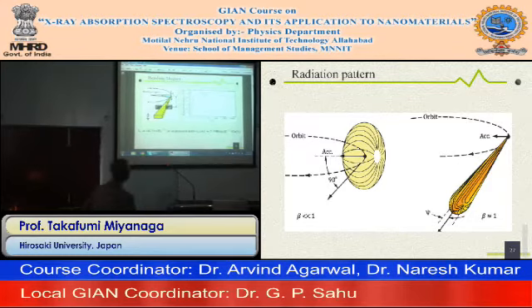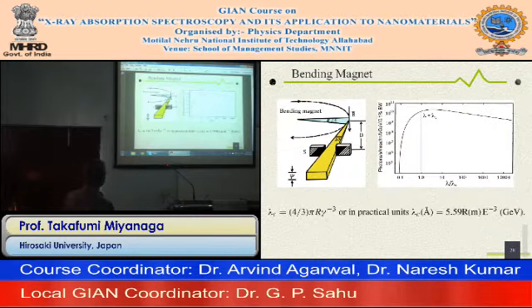It is the same picture of the magnet and the X-rays. The first original one is a bending magnet. Just one magnetic system is applied here, one set of the magnet.